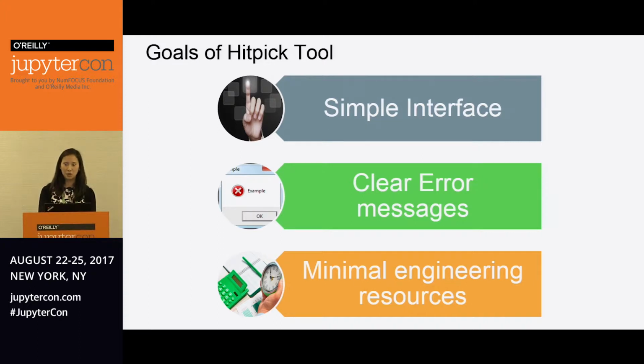And we had a few goals in mind when we set out to create this hit pick tool. We wanted to have a simple interface because a lot of the scientists aren't really used to seeing code. We do have a diverse range: we have people that write a bunch of their own scripts, and then we have other people that don't really want to look at scripts. So we wanted to create a simple interface that they could use.